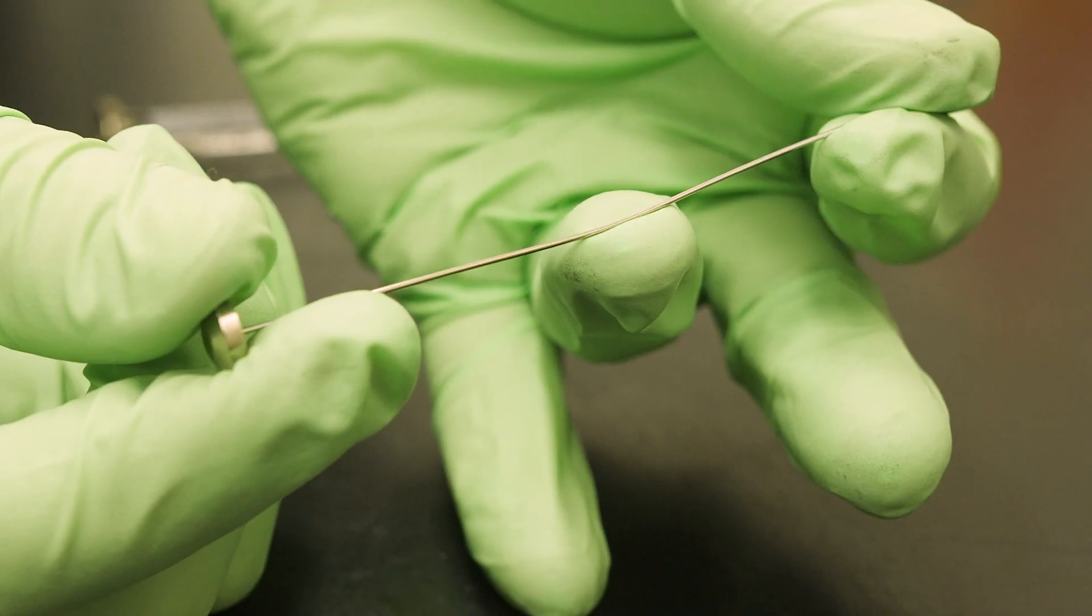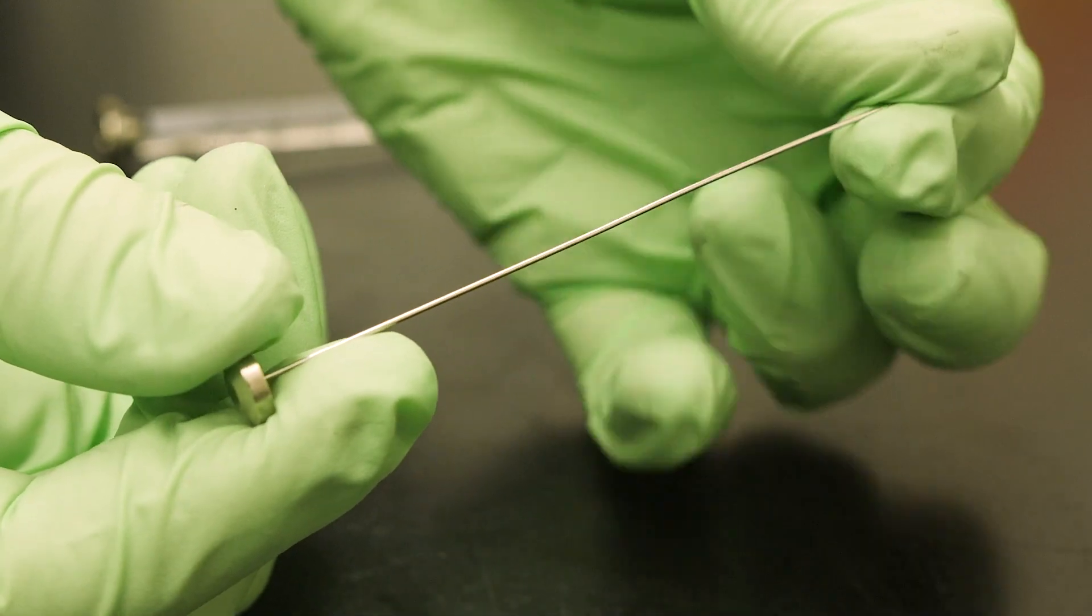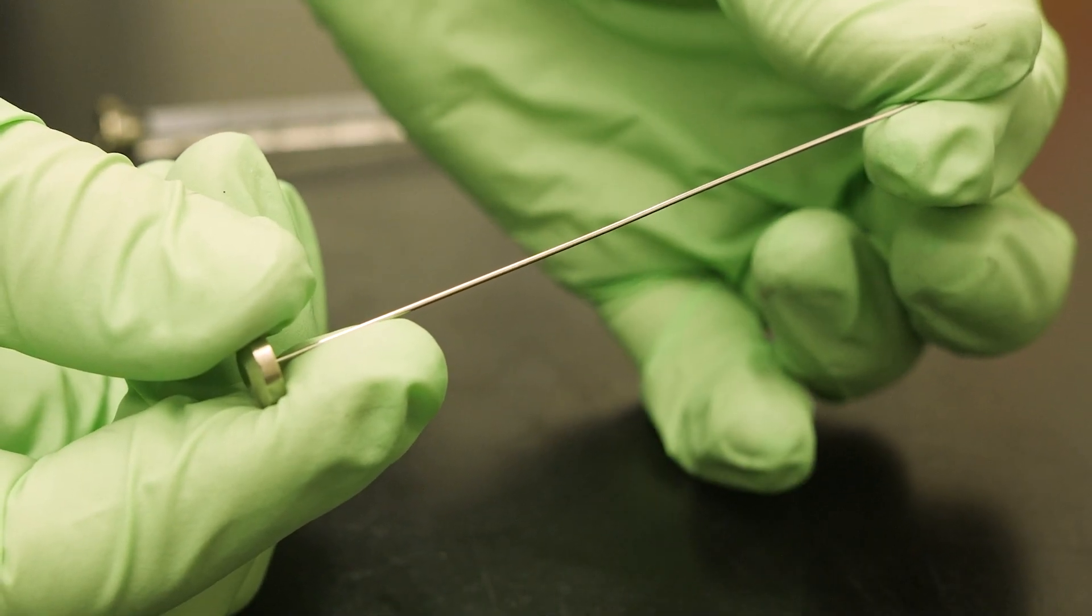Plungers should be checked for smooth operation. If the plunger is not smooth, check for bends or debris in the barrel. Bent plungers can sometimes be fixed by removing the plunger from the barrel and gently but firmly applying a reverse bend.